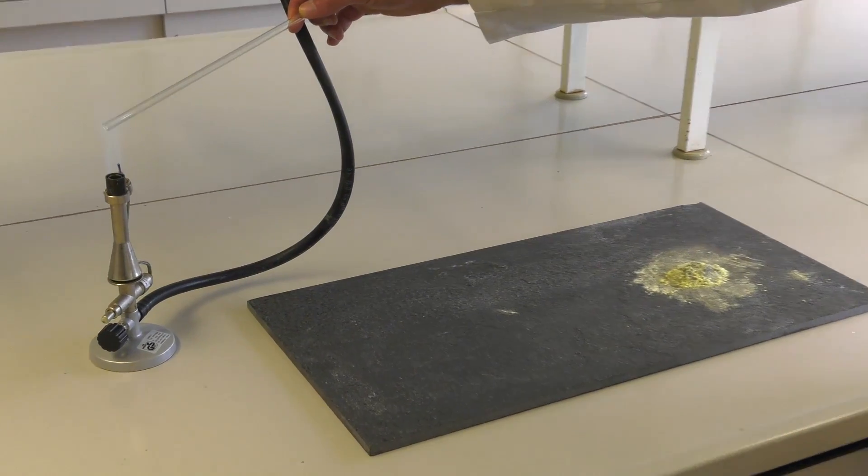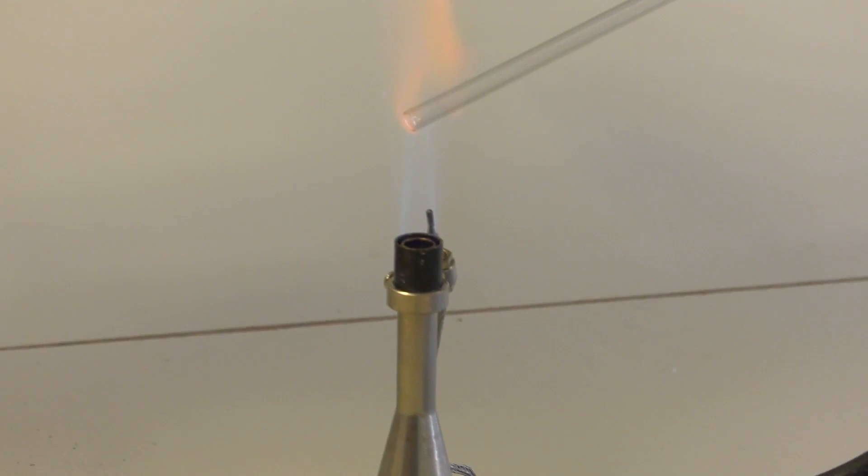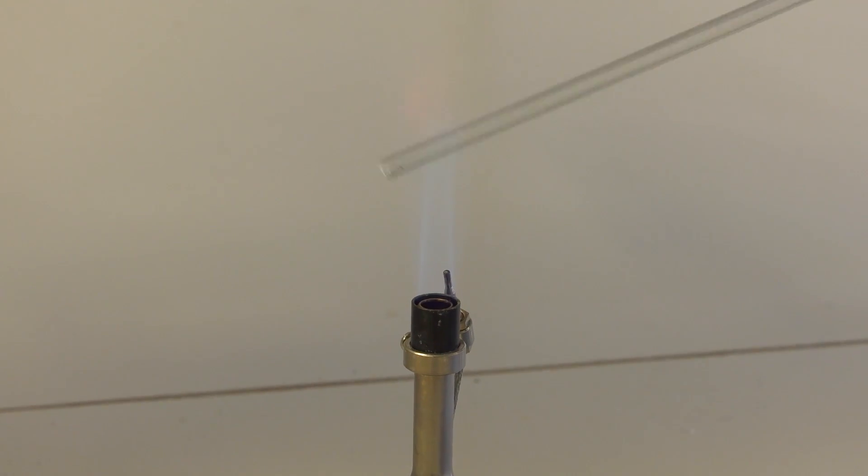If you heat a glass rod for 40 seconds with the Teclu burner and hold it into the mixture, the sulfur reacts with the iron.